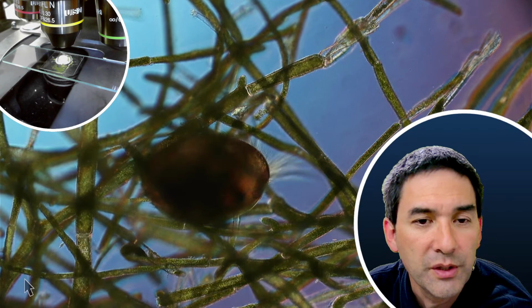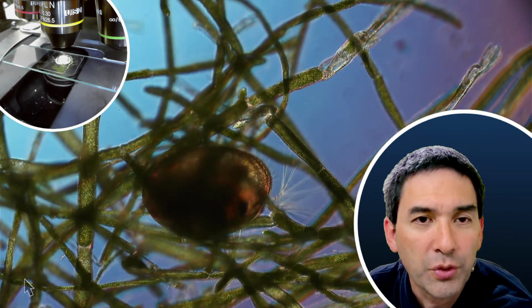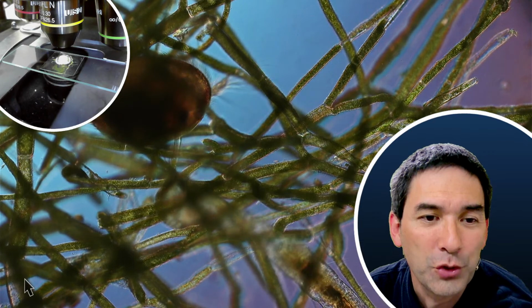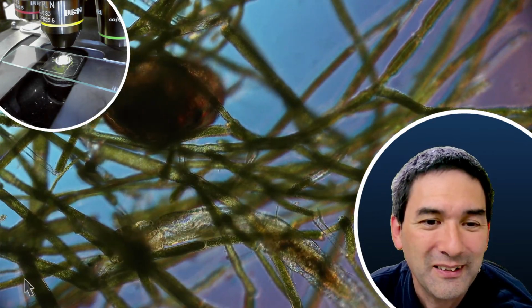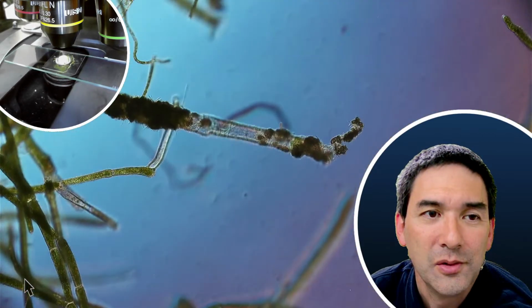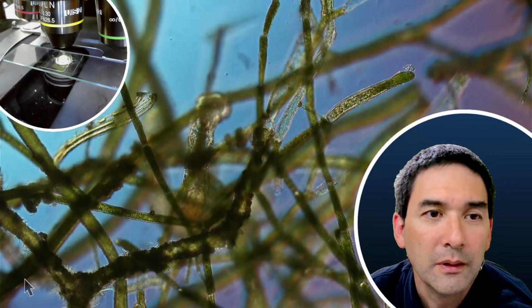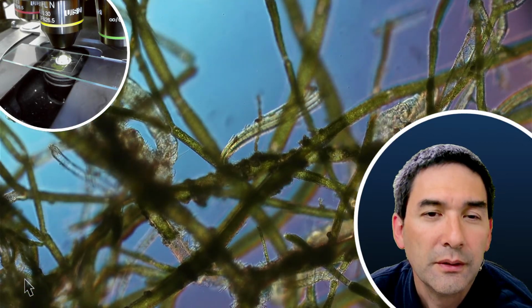Here, evidently, those ostracods are way more successful in this sample than others. Yeah, ostracods and those worms. Plenty of worms.